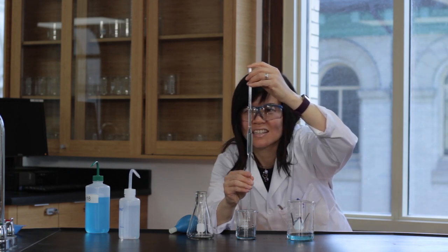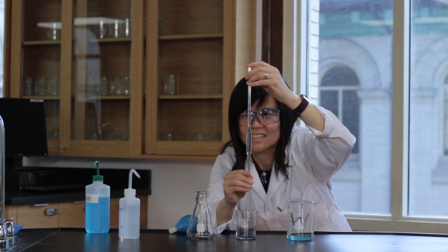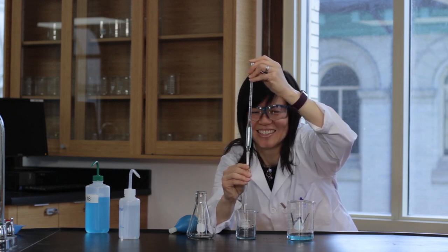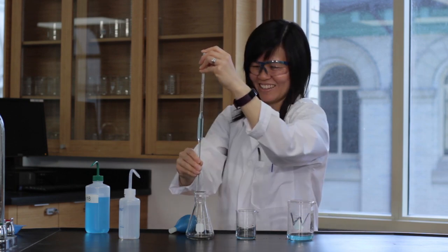Release the finger pressure slowly to allow the solution to drain until the bottom of the meniscus is at eye level. Touch the tip of the pipette to the flask to remove any partially formed drops.